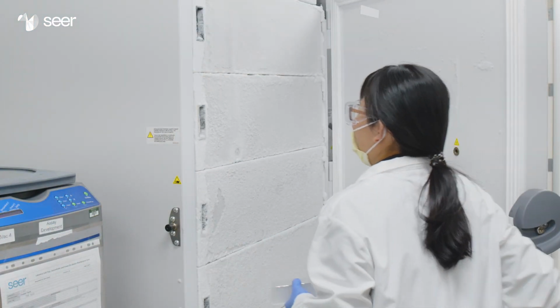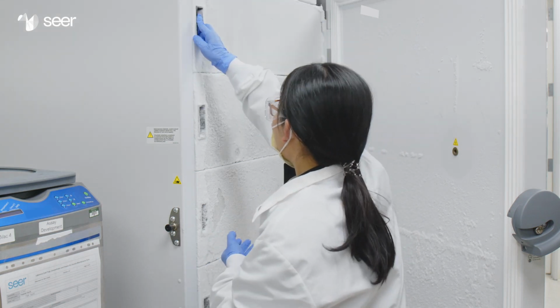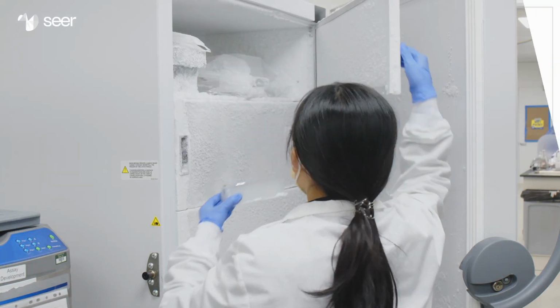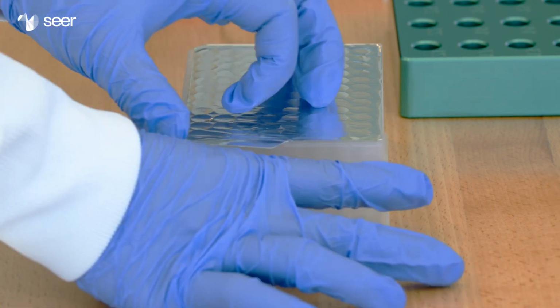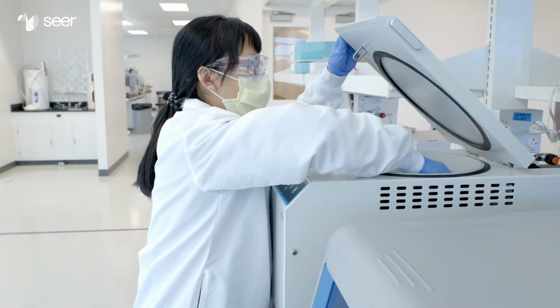At this point, you can freeze the sealed collection plate at -80°C for at least 15 minutes. Then remove it from the freezer. We recommend freezing the collection plate to prevent accidental spills when transferring the plate to a vacuum concentrator. Unseal the plate. Transfer the plate to the vacuum concentrator.